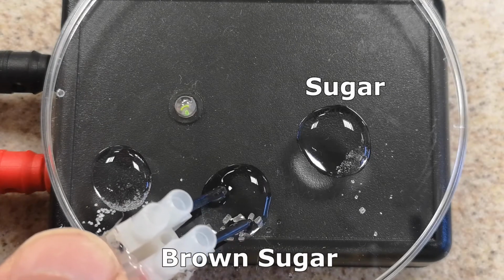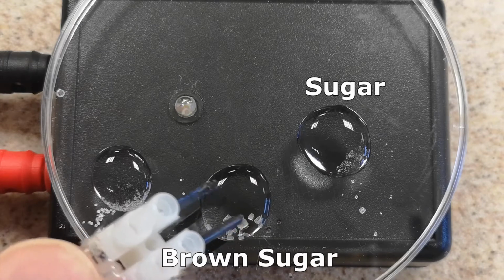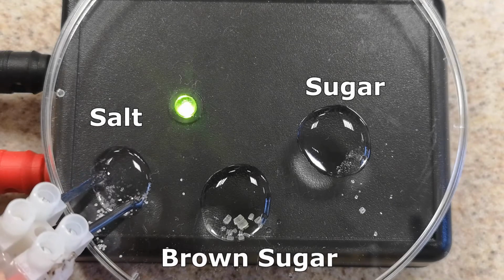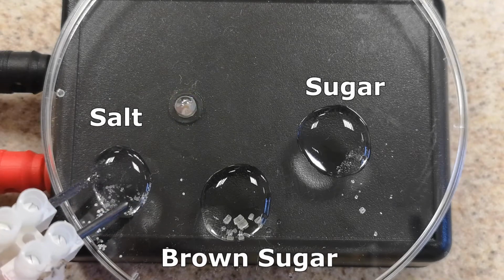The brown sugar does light up the LED a little. This is due to ionic impurities in this less refined product. And the salt water causes the LED to light up as before.